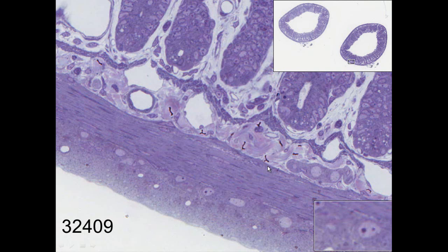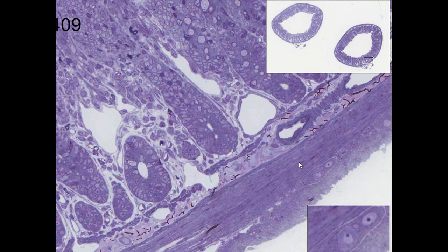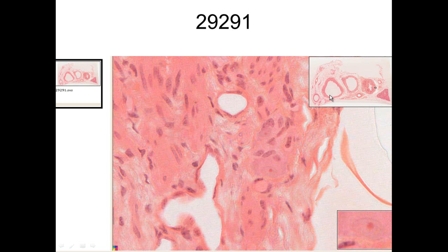In contrast, if you go into the submucosa below the muscularis mucosa, we see another plexus — this is Meissner's plexus. Meissner's plexus regulates the smooth muscle that we see in the muscularis mucosa. Again, we can see Auerbach's plexus here in the muscularis externa, and then Meissner's plexus which regulates the muscularis mucosa. These are some smooth muscle of a small artery.